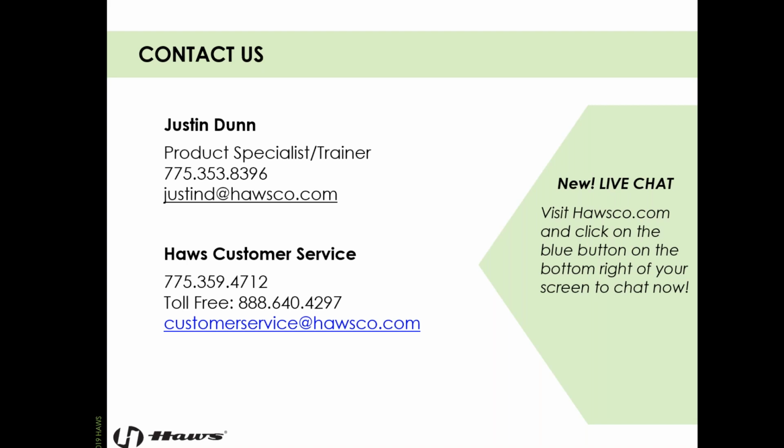Yeah, that drives me crazy. It's one of my biggest pet peeves in California right now. With how on top of things California usually is, and especially with innovation and moving the needle forward on certain safety standards, you really think they would be referring to the 2014 standard, because there's no grandfather clause in the ANSI standard. The current version is what we have to adhere to according to OSHA, but Cal OSHA, for whatever reason, refuses to update it, and it's probably because they've got so much going on, and they have a lot of standards that they have to update and adhere to. I assume they'll get to the ANSI standard eventually. Watch, we'll have the 2021 ANSI update, and they'll finally start referring to 2014.